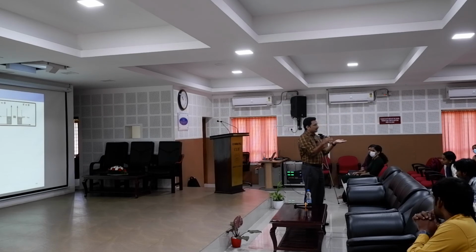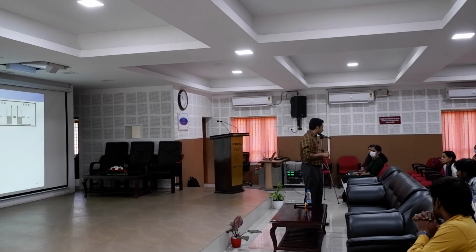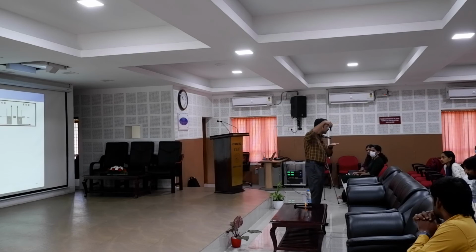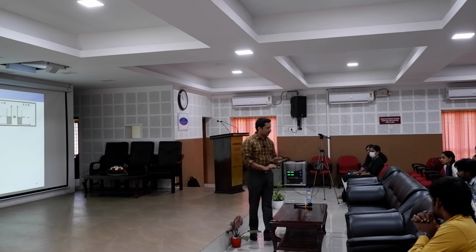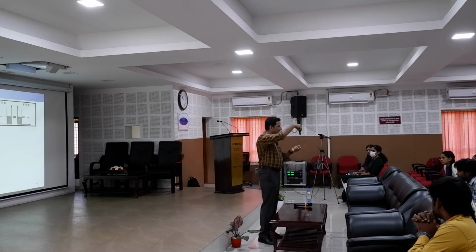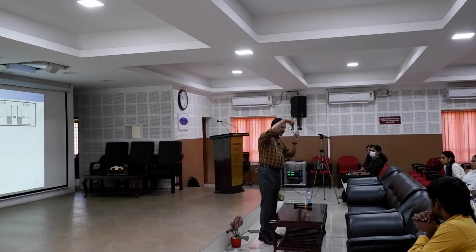Okay. Now we know that if you take a semiconductor or an organic material or any insulator, for example, the valence band is full. There are no seats. It's a houseful movie. Valence band is always full. Conduction band is empty. So if I am supplying electrons from the tip to the material, it can only occupy the conduction band, because the valence band is full. I cannot push an electron there. Which means that if I am applying negative on the tip and the sample is positive, if the electron is jumping from the tip, it will go to the conduction band of the material.